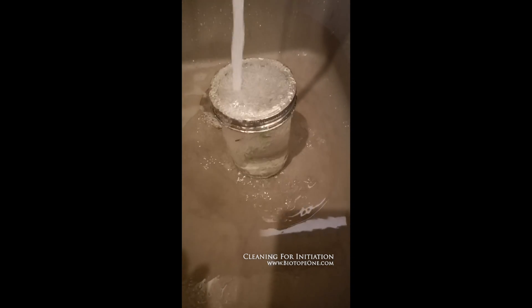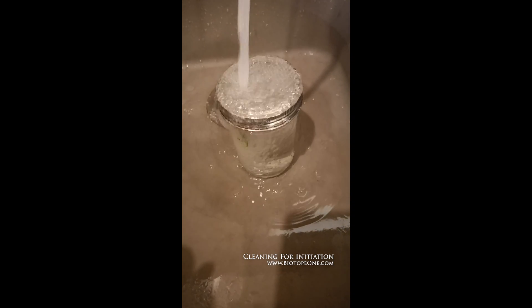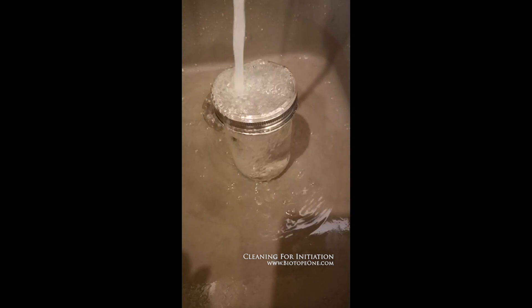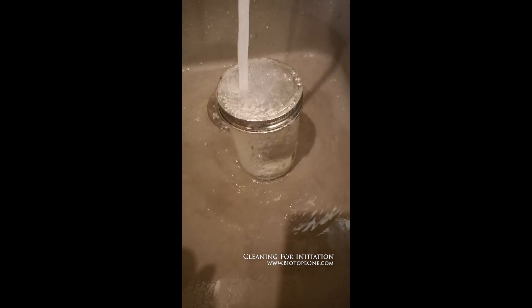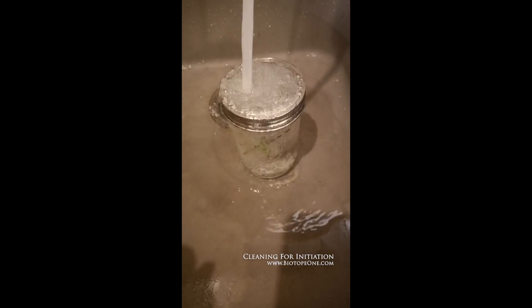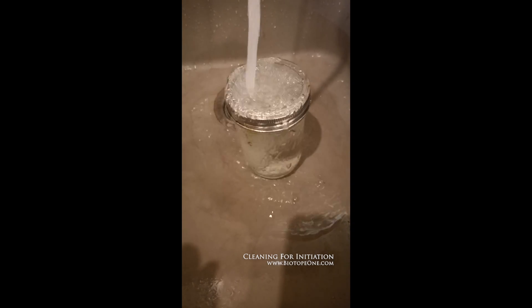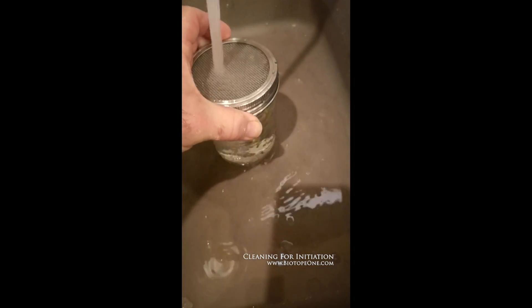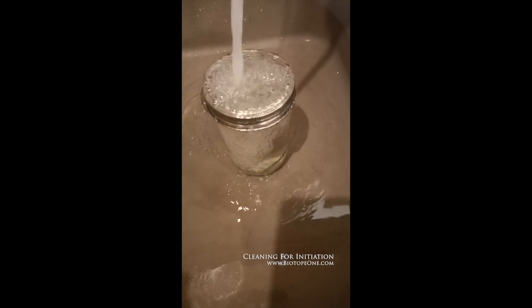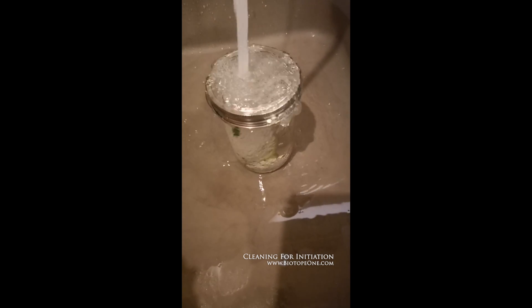Some plants like Anubias — I believe they have bacteria in the outer layer, which may be beneficial for the plant. Whatever the reason, they're harder to decontaminate and get into culture. Several plants are like that; Goose is like that too — it's very hard to sterilize. You don't want to beat it to death, but you want it to be agitated nicely so that you get the surface contaminant-free and get the big stuff washed off.